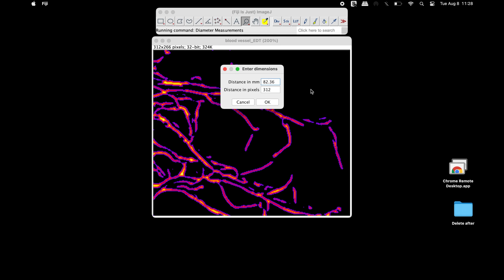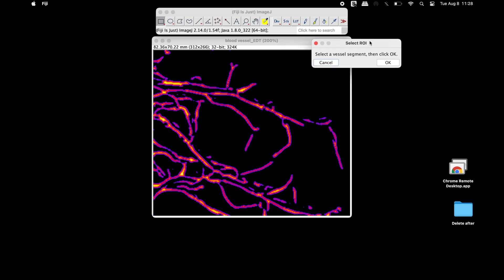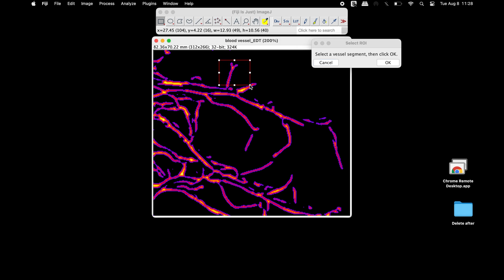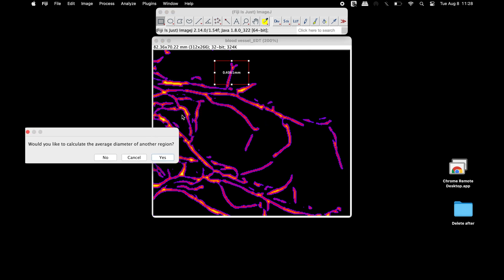Once completed, click OK. The Select ROI window asks the user to select a vessel segment and then click OK. Use the polygon or rectangular selection tool and select the blood vessel segment, then click OK. The average diameter of the blood vessel in this segment is 0.4 millimeters.